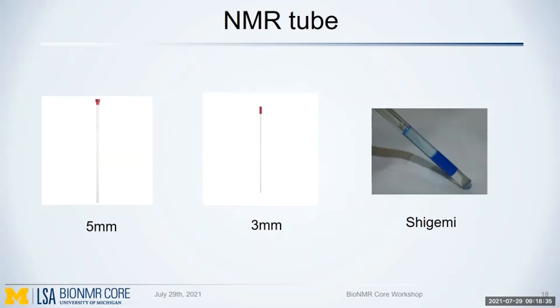And once you add that, since the top and bottom glass parts of your tube still match the solvent property, you will not have any problem in shimming. So you will still have good shimming, good line shape, and good sensitivity by using those Shigemi tubes.